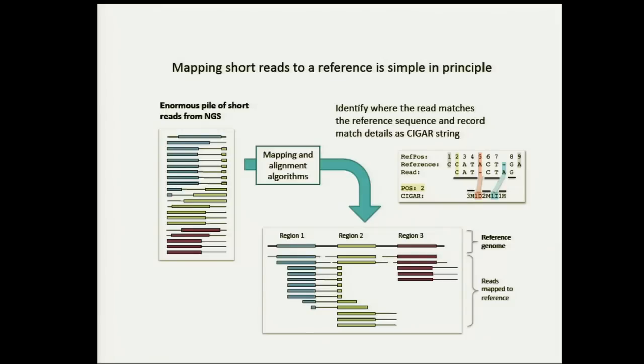Then there are two matches for the CT, and then the Cigar string tells you that the following base is an insertion. So that A, although for the machine it just read as a sequence, relative to the reference genome represents an insertion, right? So the Cigar string makes it really simple for you to look at the bases, the sequences, and place them on the reference genome. But the concepts of insertions and deletions are a little complicated to grasp because you don't really see them in the sequence. You have to remember that the sequencing machine really only reads what's in the DNA.